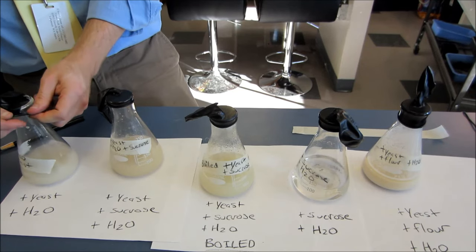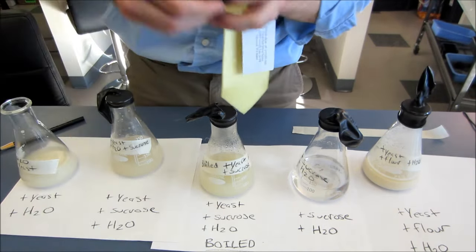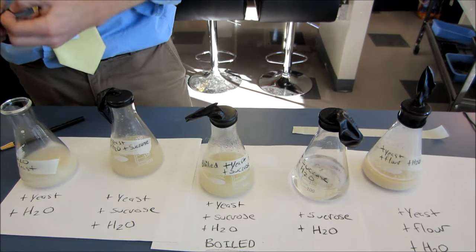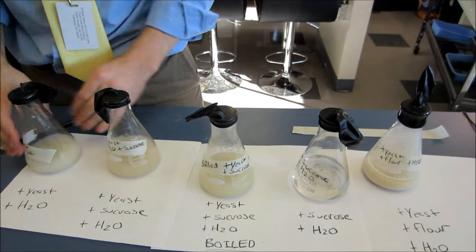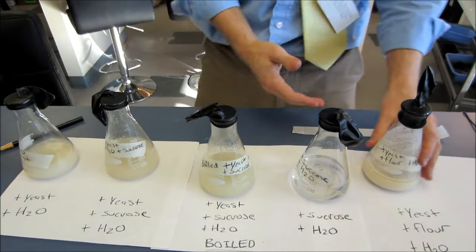Oh! This one just broke, so I'm going to put a fresh one on. Okay. There we go. So now I'm going to leave them for 24 hours, and we're going to see what happens.